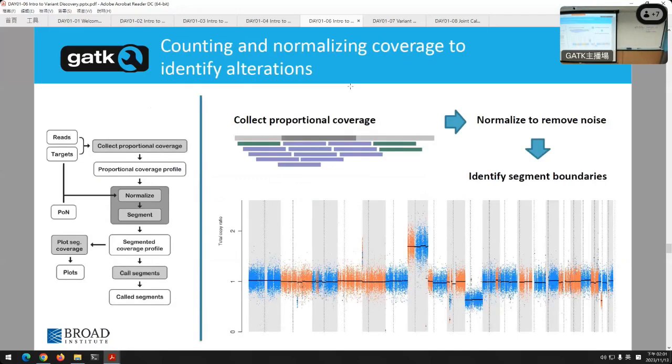It's very complicated because, remember, a lot of the cancer sequencing is done at the exome, because again, you really mostly care about the genes and how those are affected. So the exomes we talked about being inconsistent. Any one exon is very different from exon to exon.